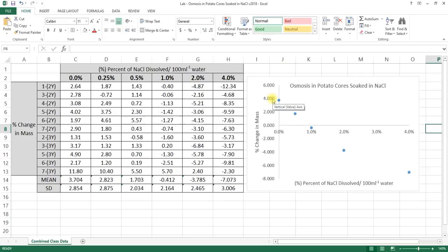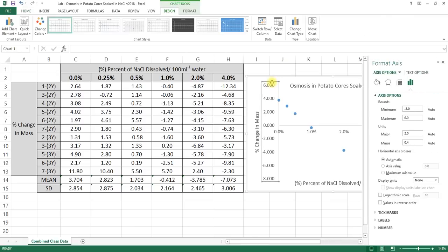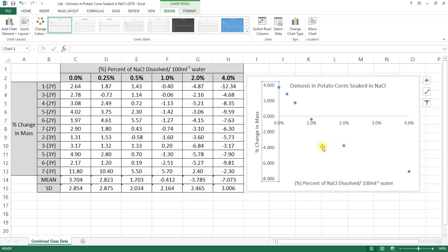Although if I look at it, I'm not so sure that we need to start all the way at 6. I don't think there's going to be anything on our y-axis that's really going to go higher than +4. In fact, 3.7 there is the highest. So let's not even go higher than 4. Let's just go to 4 and be done. So double-click on your y-axis, and let's go to 4.0 instead. Okay? And if we look, that obviously fit much better, and therefore, again, we're making better use of space of our graph.